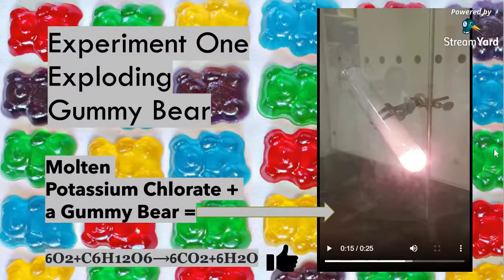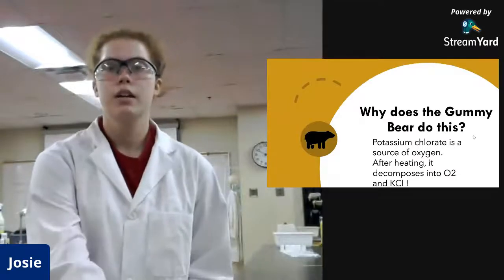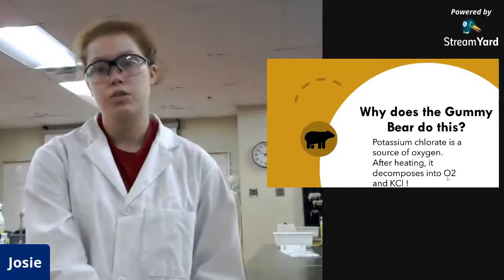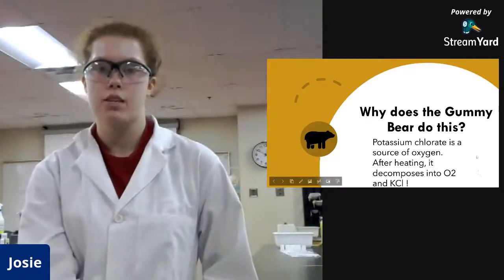And what happens is we all know gummy bears have a lot of sugar in them. And sugar has a lot of oxygen in it. So when it is dropped into the molten potassium chlorate, some of the oxygen can come off of the sugar and add fuel to the fire or this combustion reaction. So like I said, potassium chlorate is a source of oxygen as well as the sugar. And then after heating, it decomposes into oxygen and KCl.